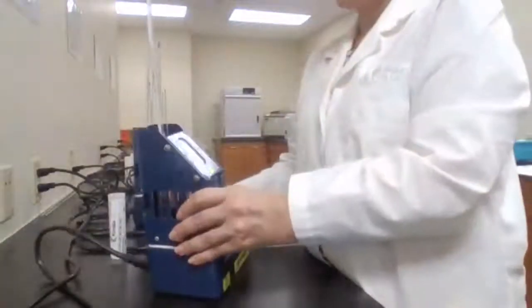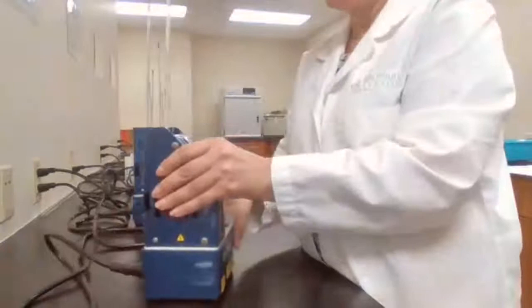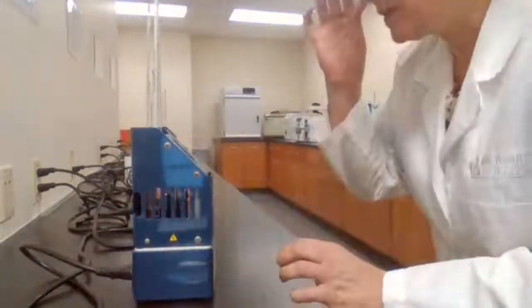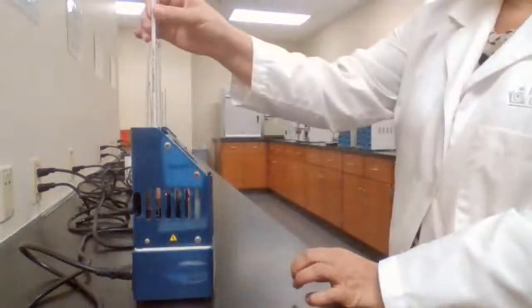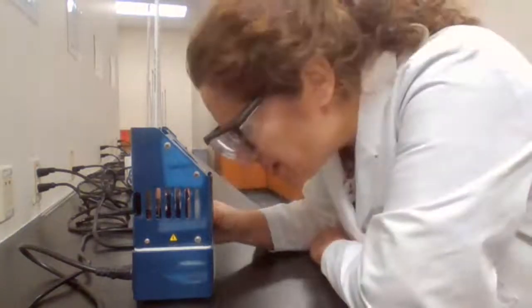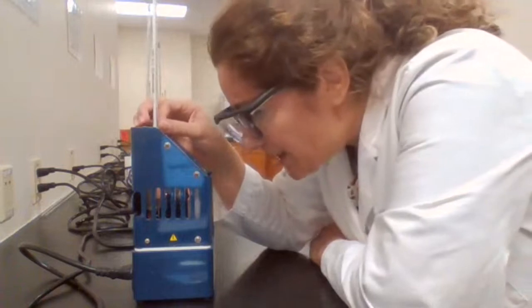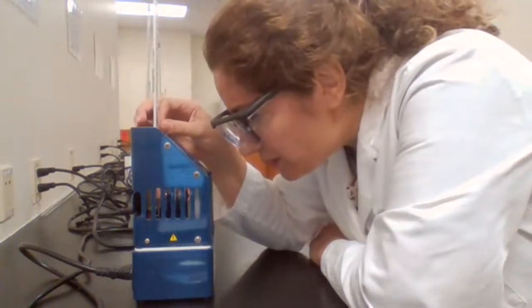So we set the melt temp power regulator between 4 and 5 here. And we wait, and we don't want to miss the melting point. Make sure you record the melting point for initial melting and then for final melting.